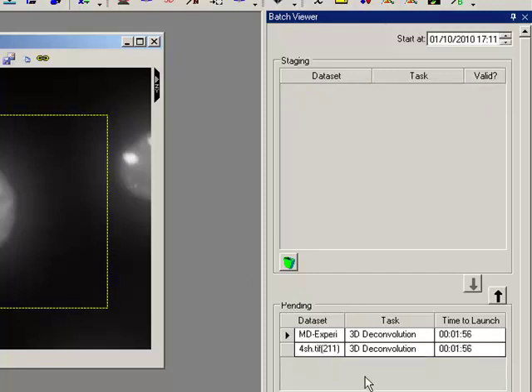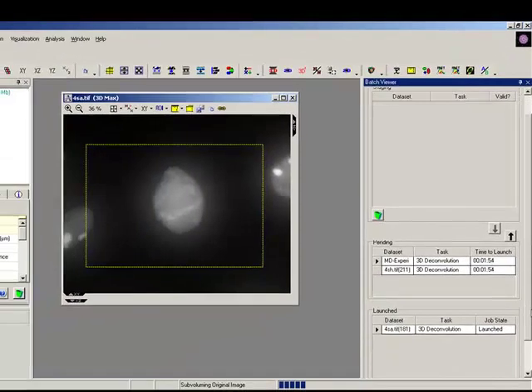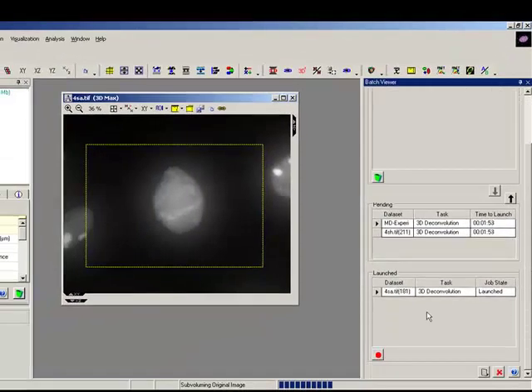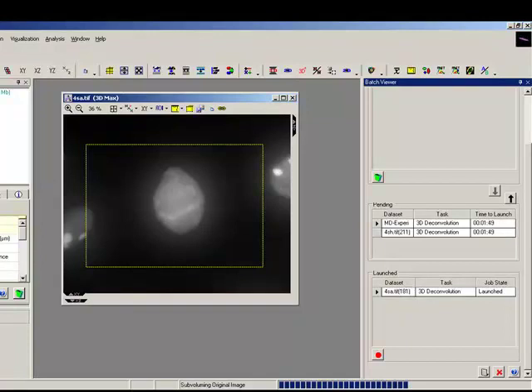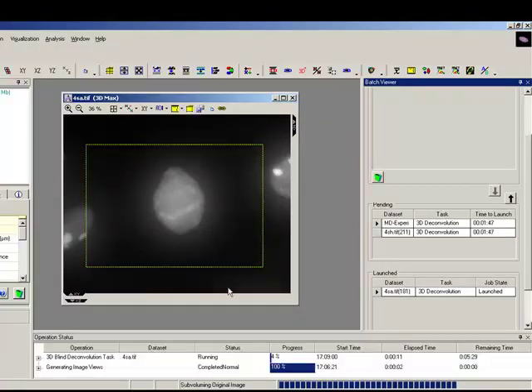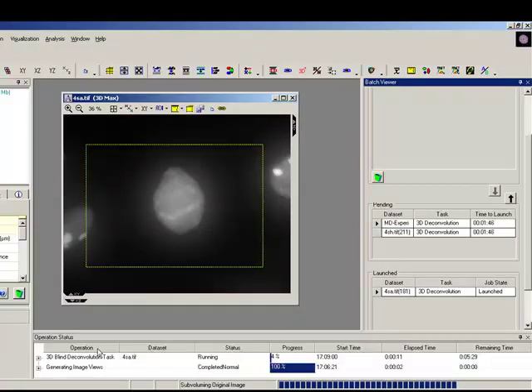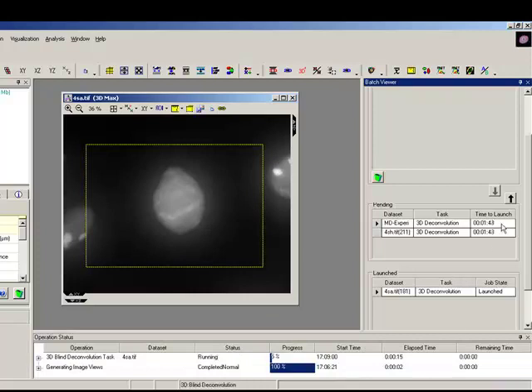So we can see the first one we launched now has actually been launched, it's deconvolving. We can see here if I view display status, there we go, it's actually doing the 3D deconvolution task and my other datasets are going to launch in 1 minute and 40 seconds.